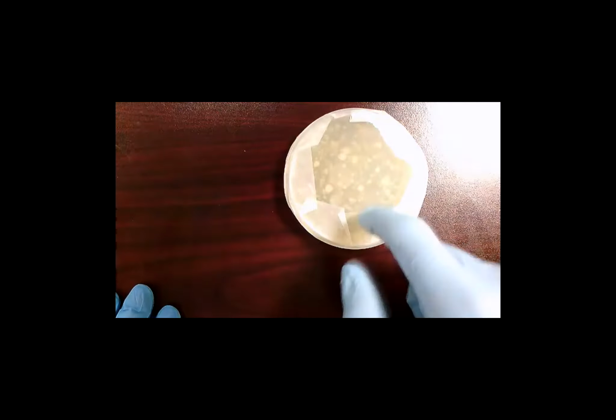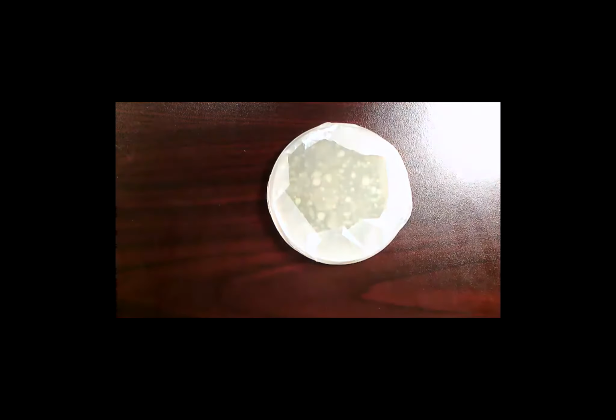So, all right. And just another clarification. Yes. How old are these again? These are 48 hours. We plated these on the 7th. And this is approximately the type of growth the students would expect to see at the career development event.